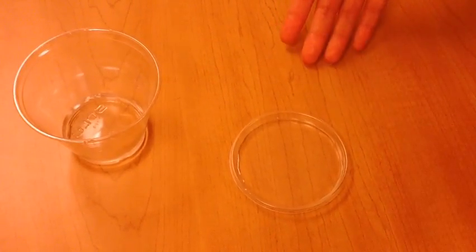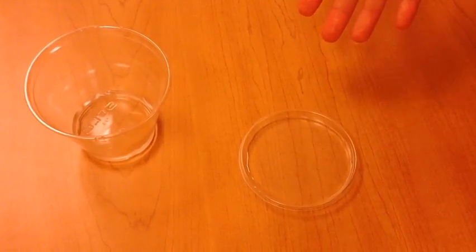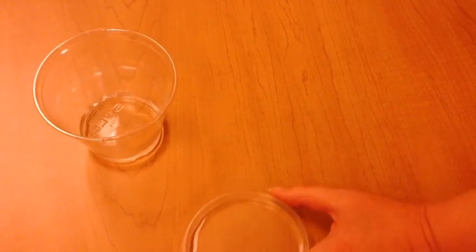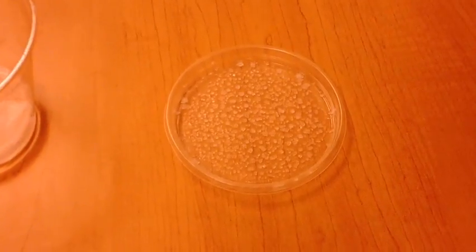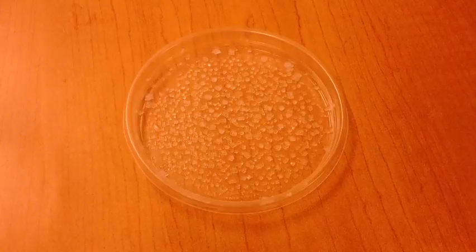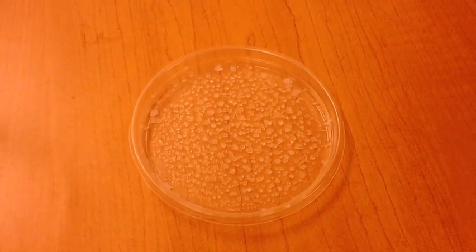Because if it's just water, the water is all going to evaporate away and I'm going to have an empty evaporation dish. However, at the end of that time, if I see crystals in the dish, that means that the water evaporated and left these crystals behind. Those crystals are the other material that was mixed into the solution.